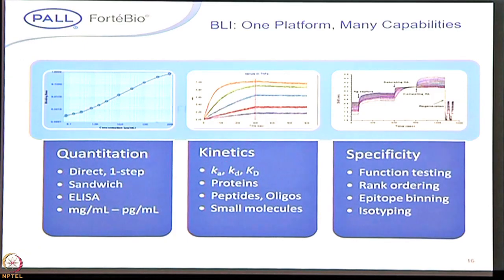For the kinetics, as I mentioned, you can determine on rates, off rates, and the affinity constant, irrespective of whatever the biomolecules are. Maybe protein to protein, protein to small molecules, protein DNA, protein RNA, and so on.